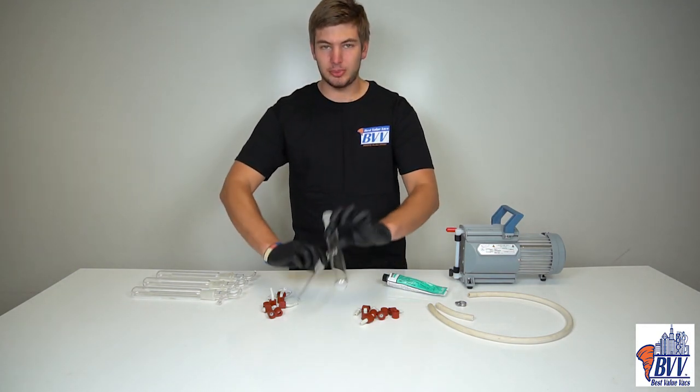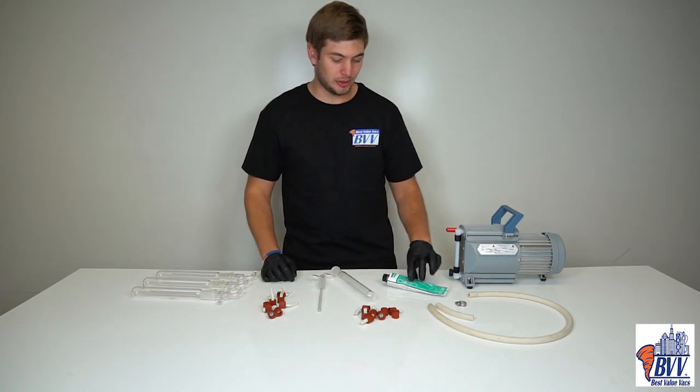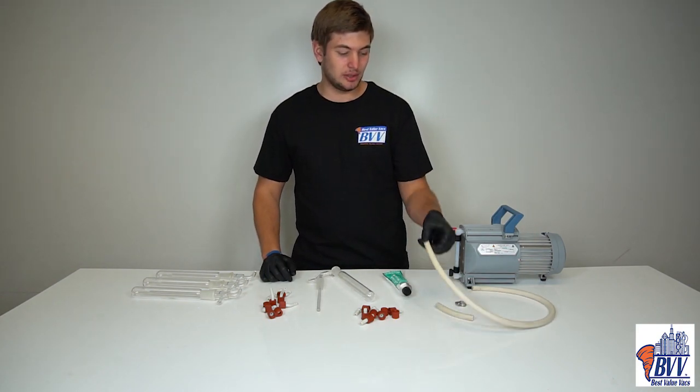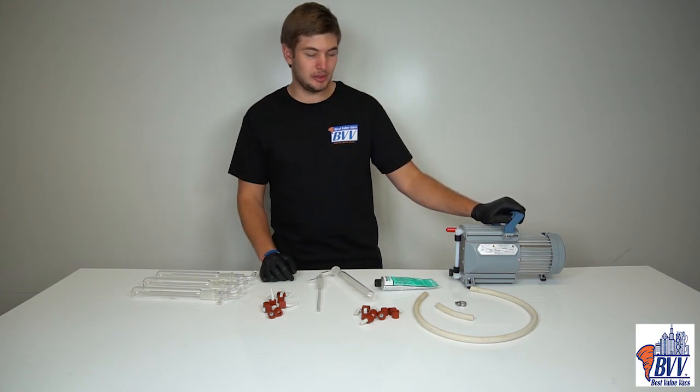So right here we have the two-part cold trap piece. We have some GL14 barbs. We have our vacuum grease. This is Dow Corning. We're using a gum rubber vacuum hose, and we have our vacuum brand pump.